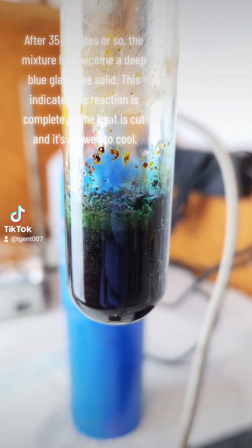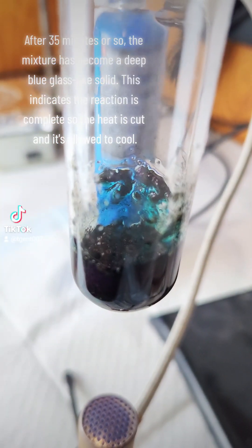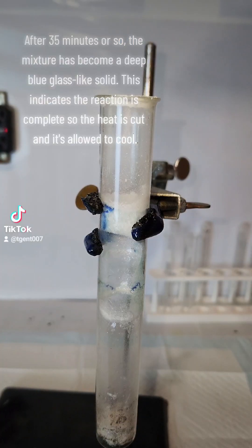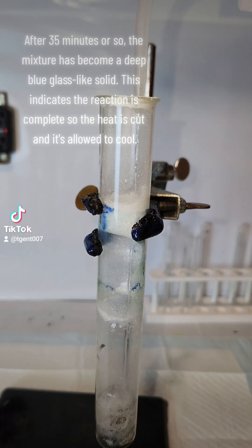After 35 minutes or so, the mixture has become a deep blue glass-like solid. This indicates the reaction is complete, so the heat is cut and it's allowed to cool.